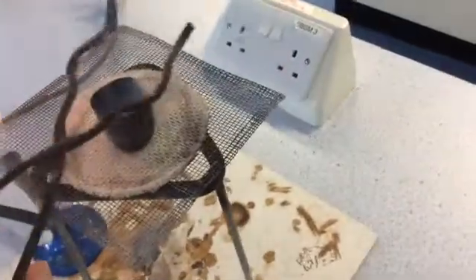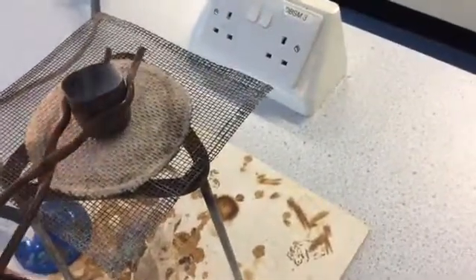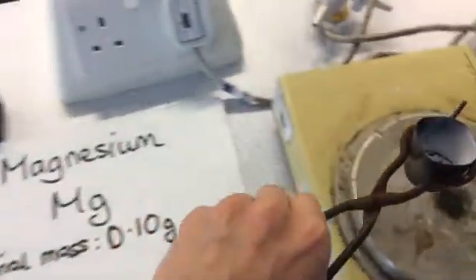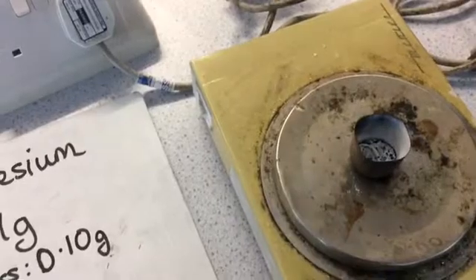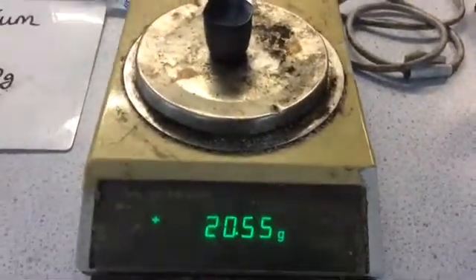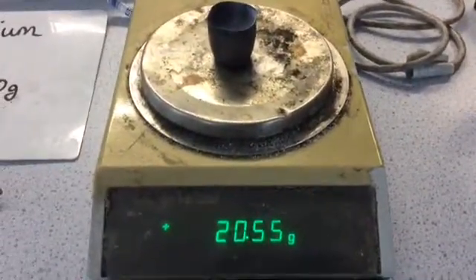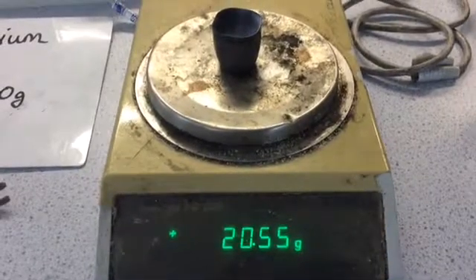So you can see that the tongs have a special bend in them which is designed so that they can pick up the crucible really easily. So I'm going to come over to the balance. And you can see that the mass is now 20.55.